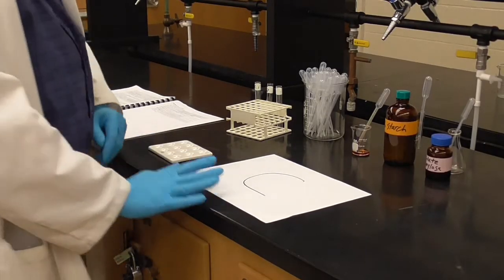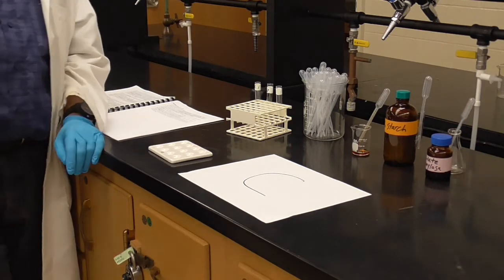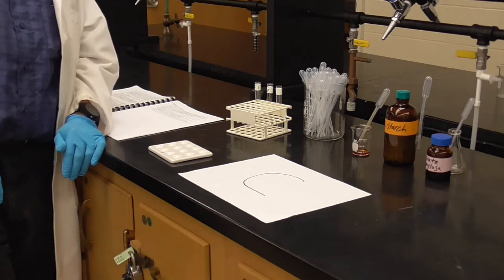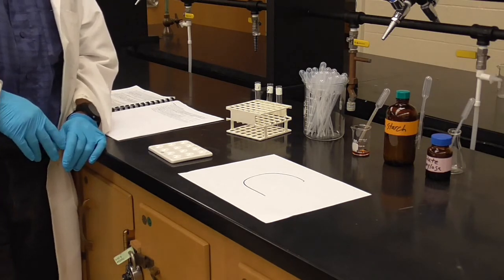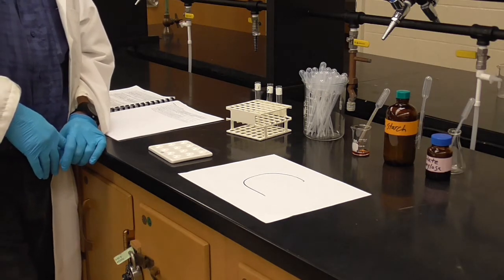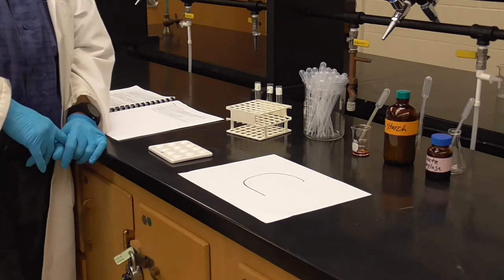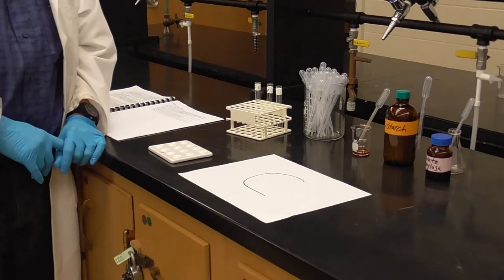Okay, part C. Here we're investigating the effect of temperature. All right, so in a normal reaction, of course, the hotter you make it, the faster the reaction goes. Every 10 degrees you increase, the reaction rate more or less doubles. That's our rule of thumb. Is that true for enzymes? Here we have a reaction that does not happen, the starch breaking down, unless our enzyme is present.